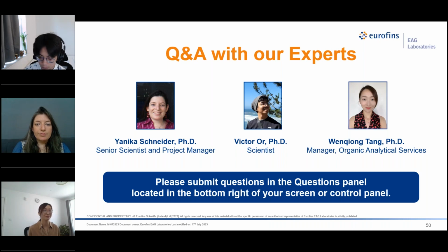So yeah. Wow, that's a great answer. Thank you. Okay, we have one more question. How do I know if Raman or FTIR laser is destroying my organic samples? Can I tell by just looking at the spectrum?